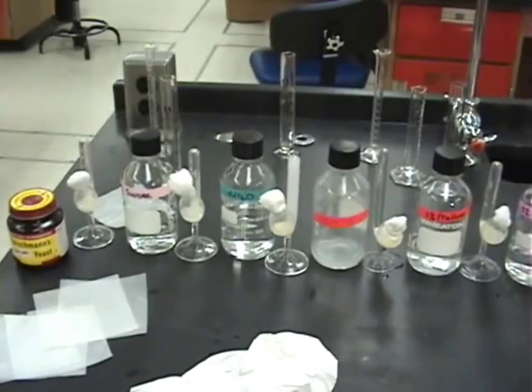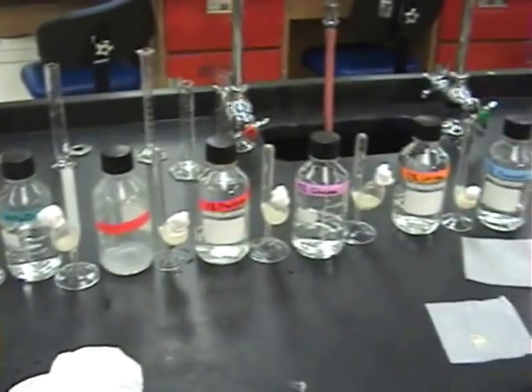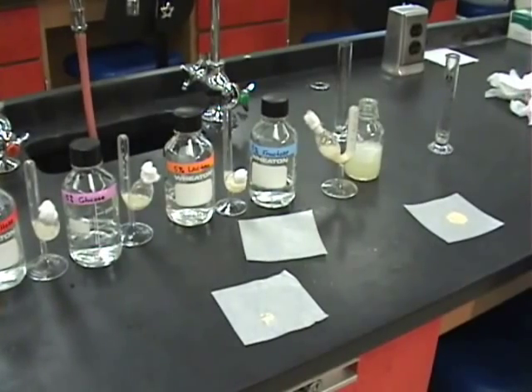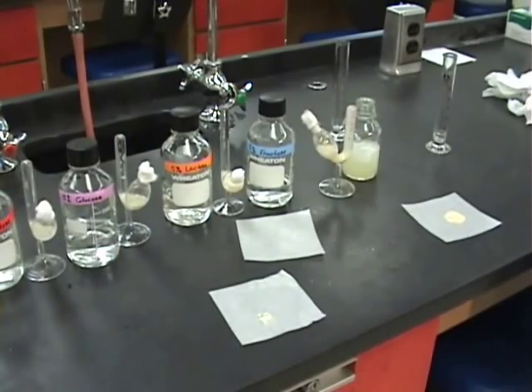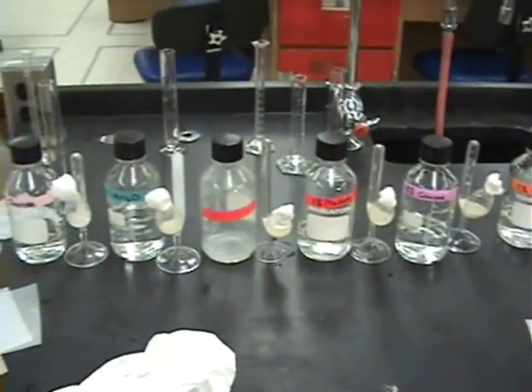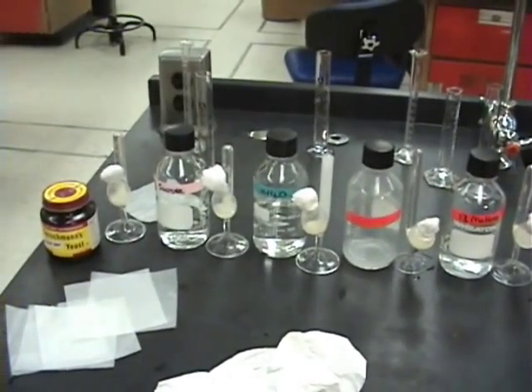All the yeast have been added to their fermentation tubes and gently mixed so they're distributed throughout most of the tube. They have their cotton ball in place to contain the gas, which will be measured in the calibrated end of the tube to determine displacement.